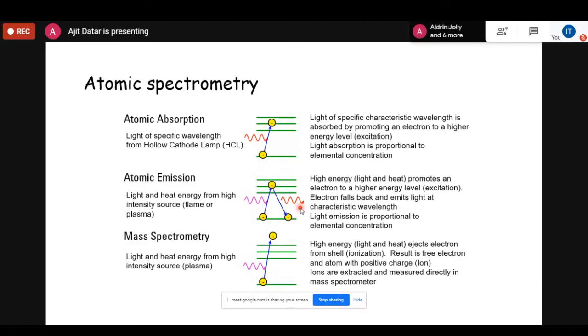with other different wavelengths. So when we use atomic emission spectroscopy in this format, analyzing a number of lines which are coming at different wavelengths, we can find out which element is present. So by atomic emission spectroscopy, which is called ICP-AES, that is inductively coupled plasma atomic emission spectroscopy, we can determine more than 70 elements. And this is done very fast because of the present detectors which we have. We can analyze 70 elements very fast.